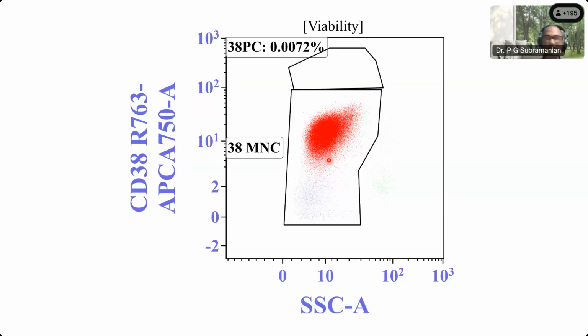So next, who is next? Can Soumya take it up? In this scatter, it's CD38 positive. Yeah, it is CD38 positive.